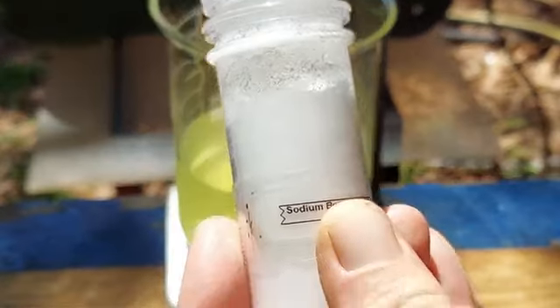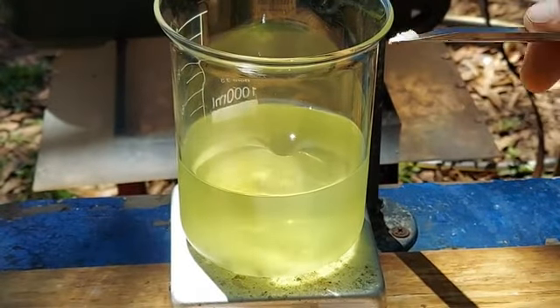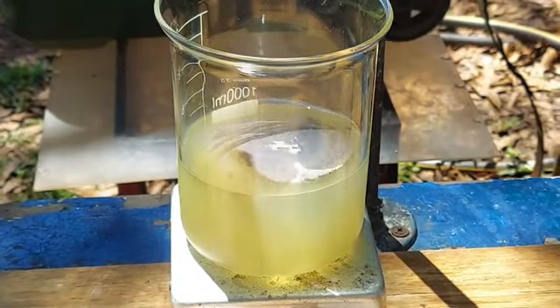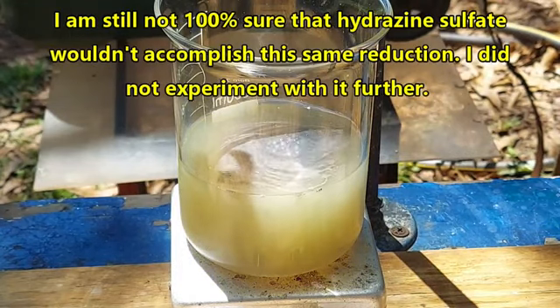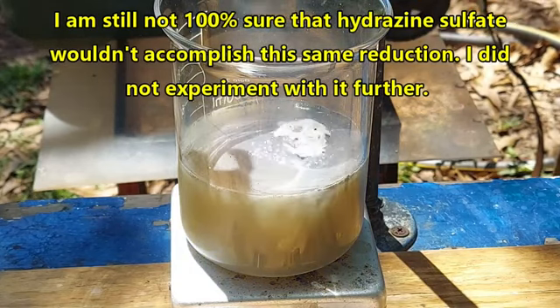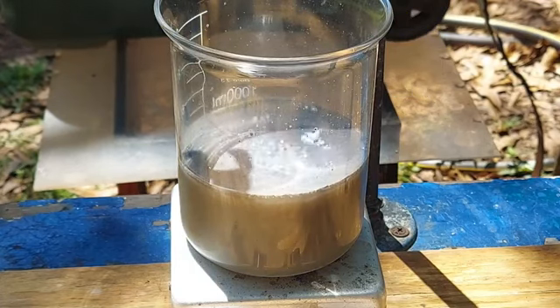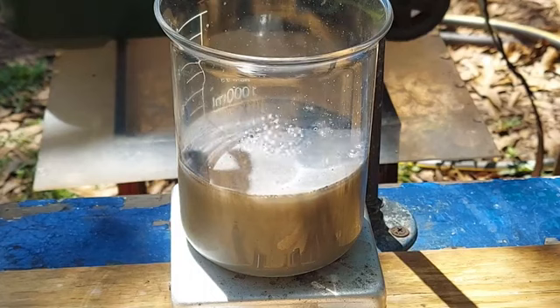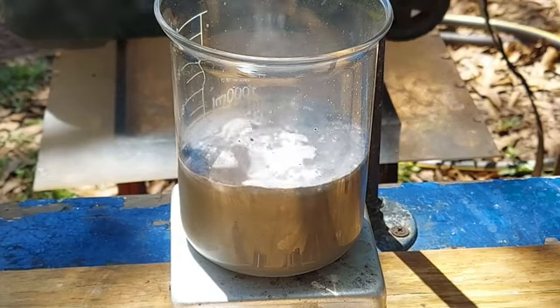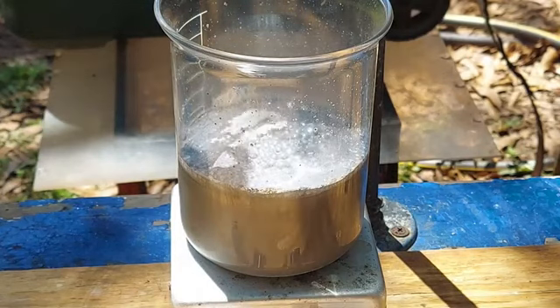Well, here's sodium borohydride. Same old, same old. You guys have seen it a million times on this channel. And we are just going to add it in there. As you see, it starts precipitating out elemental mercury rapidly. Now, the nice thing about this is that if you add enough of it, eventually it will completely drop out the metal as a nice isolated solid on the bottom of the beaker. And hopefully it will not go back into solution, which is one reason we wanted to raise the pH a little bit. One of the reasons.